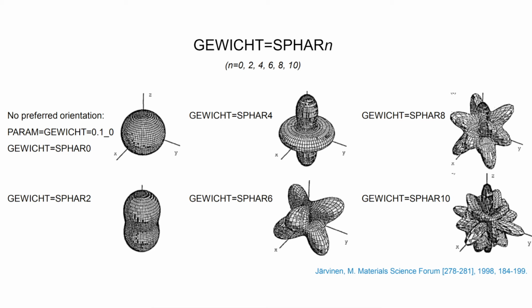So be very careful with spherical harmonics of the 8th and 10th order. If you still cannot fit your mismatches in intensity with 4th order or maybe maximum 6th order, there's probably another reason and not just texture responsible for the intensity mismatch.